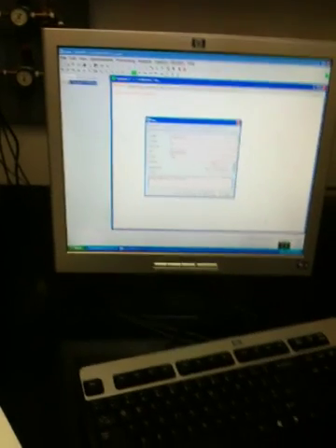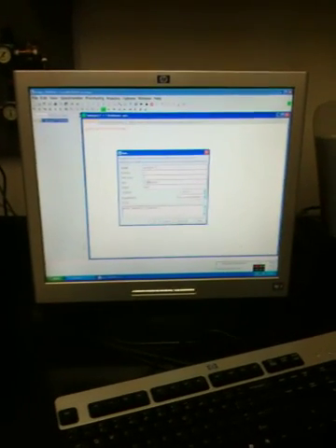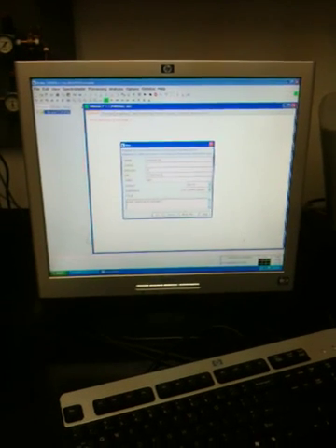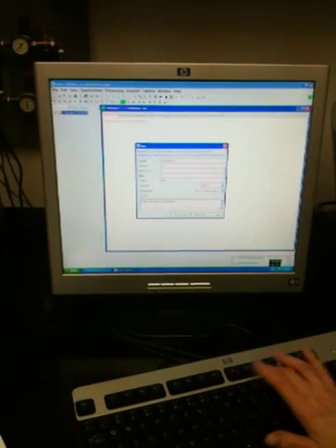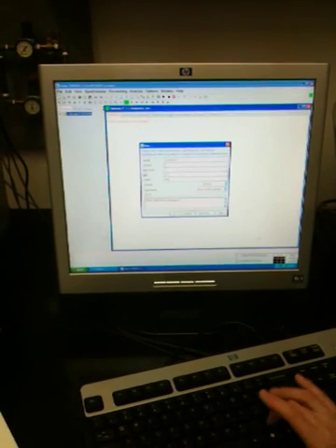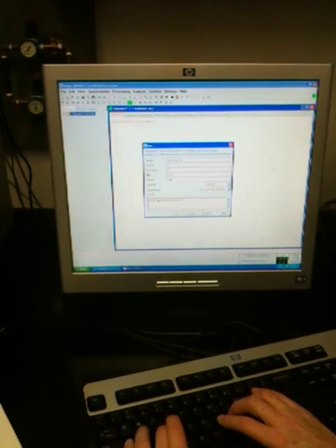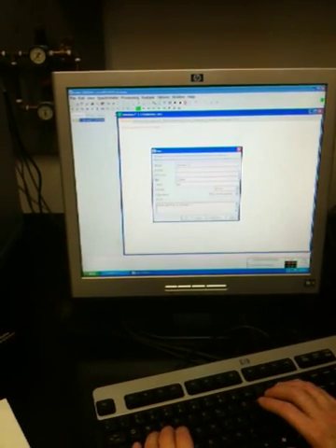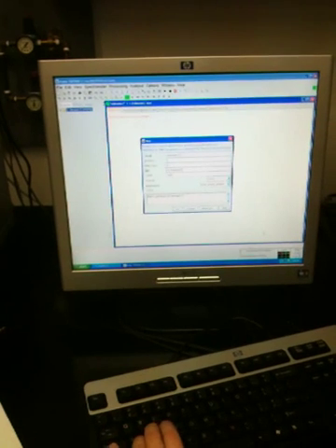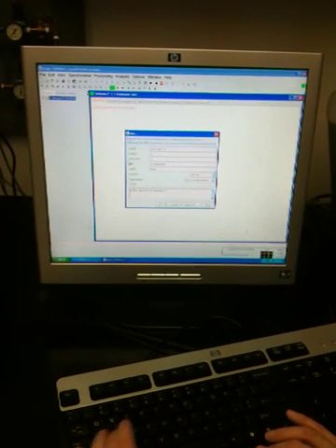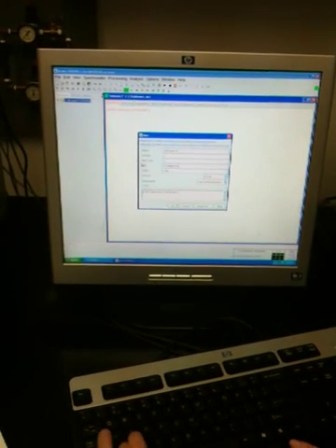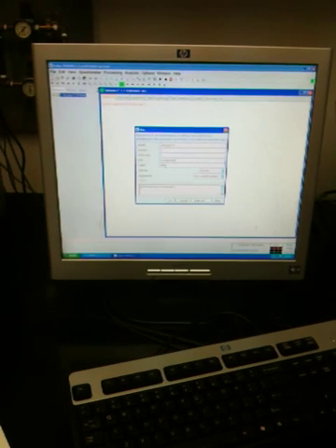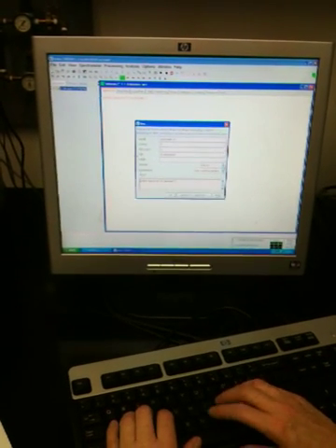The directory should always be capital D colon slash data slash NERS. I'll type that in one time so you can see me doing it. Oops. You can see what a bad typist I am. The user is me, so I'll just say NERS.